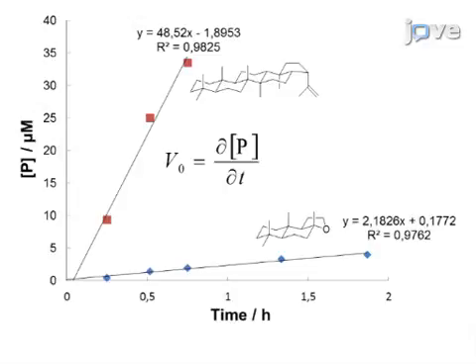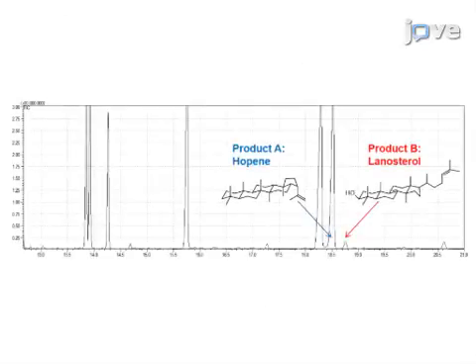Perform linear regression of the data points corresponding to less than 10% conversion. The initial reaction speed is given by the slope of the fitted line. For one-pot relative kinetics with multiple substrates, obtain the relative apparent kcat/Km values using the equation listed in the text protocol, following the cyclization reaction over time.